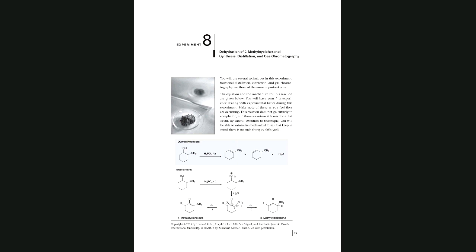We already talked about the reaction. Now we have to assemble the fractional distillation. Why fractional distillation? Can we use simple distillation to make it easier for me for setup? I don't know. We always have this vacuum distillation out here. Can we use simple distillation? Did you answer that, or what factors are going to tell me to use the simple distillation?